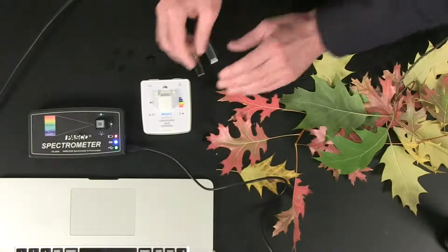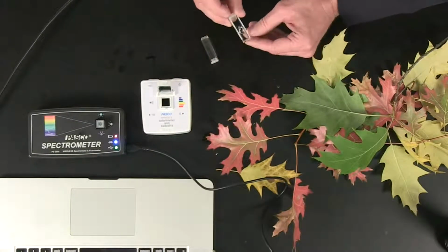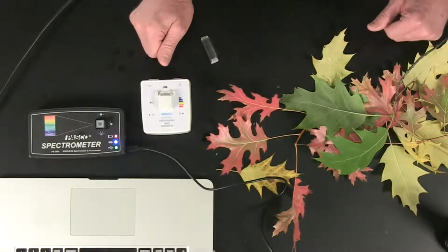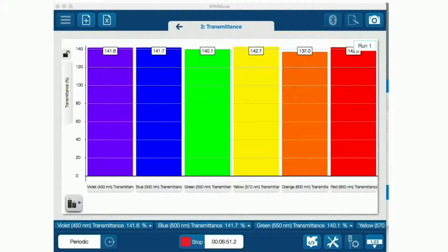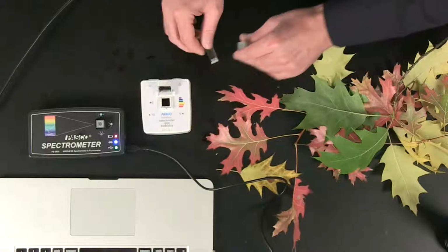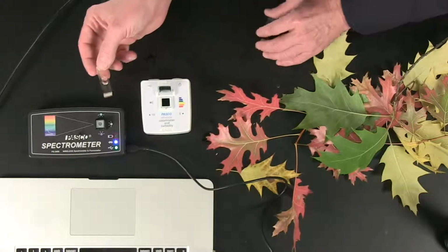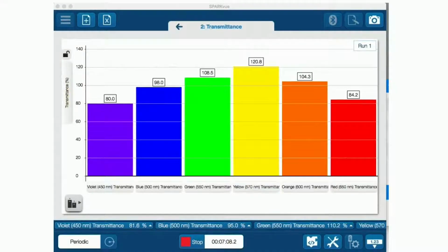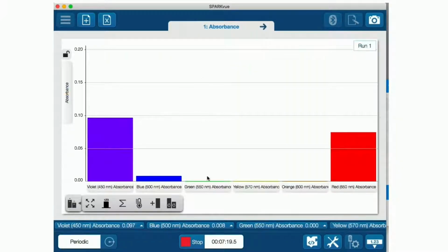And when I look at those, I'm going to open this up and put in, same as before, my sample of the vegetable oil. Remember, we are not expecting to see anything very exciting with the vegetable oil, and look, it's not. It is actually transmitting 100% across all the different colors. But if I take out my vegetable oil and I put in my sample of olive oil, look what happens. Wow. We see a difference in the transmittance, and we would expect to see a difference in the absorbance, just like we did in the spectrometer. Let's come over here and take a look at the absorbance. Here it is. Wow. And remember those two colors that we talked about.